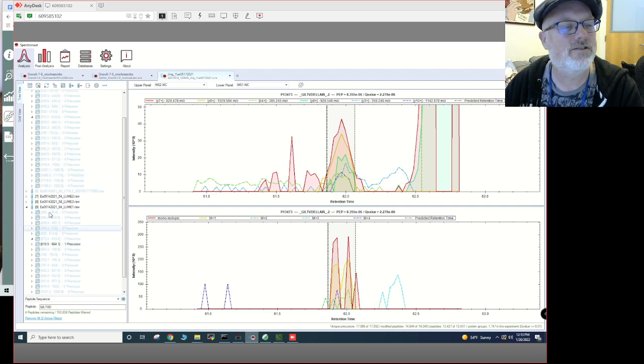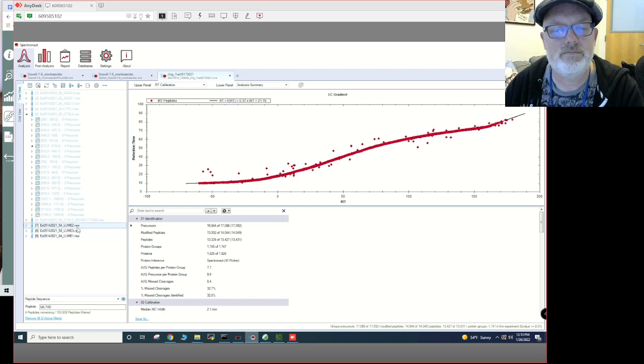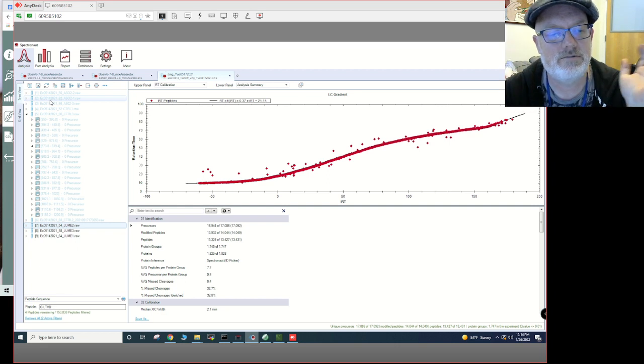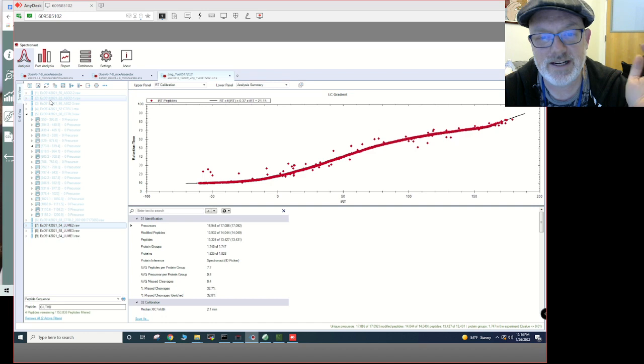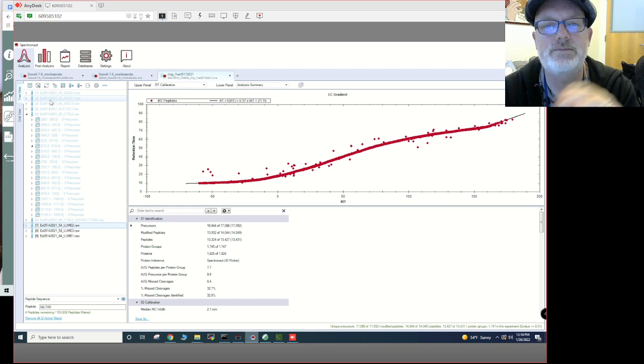Okay, so anyway, this is how to go through some of your Spectronaut data relatively quickly. I thought it would be quicker, but sorry about that. But I'm pretty happy with this result. We've shown that the one protein was only identified with one peptide. So this shows you that sometimes it's good to filter those away, sometimes it's not. In this case, it was good to keep them because we actually showed some good mass spec evidence that this protein was not in our controls and not in our other conditions, which is good evidence that the experiment was done correctly.